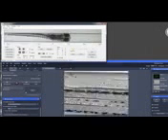When using the VAST in this configuration, after imaging with the onboard camera, the VAST follows a list of user-defined imaging jobs. Each job is a set of instructions to rotationally and linearly position the larva under the lens of the external microscope, allowing the user to manipulate their microscope and equipped camera to capture appropriate bright field and fluorescent images, before instructing the VAST to continue to its next job.